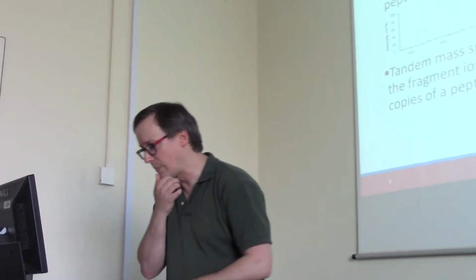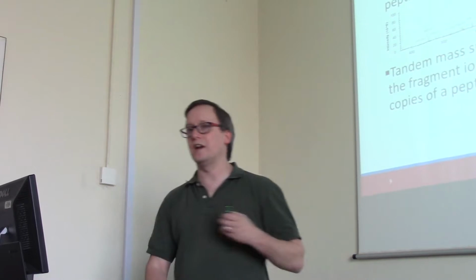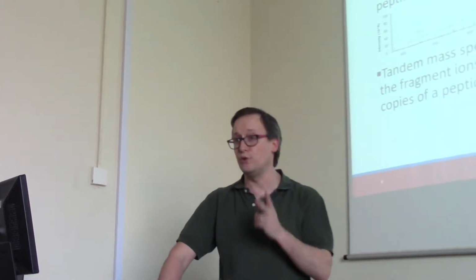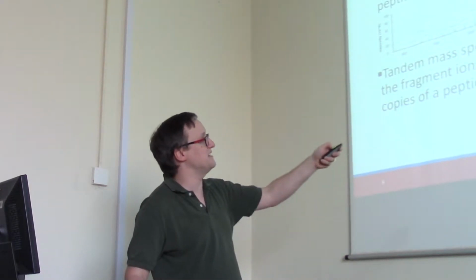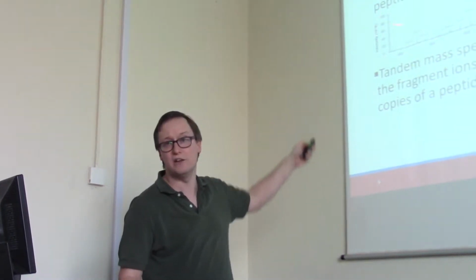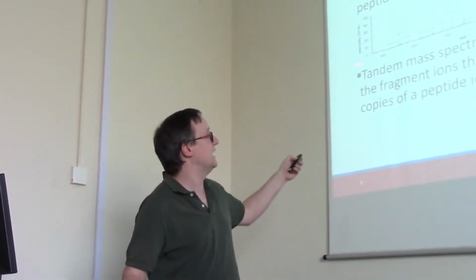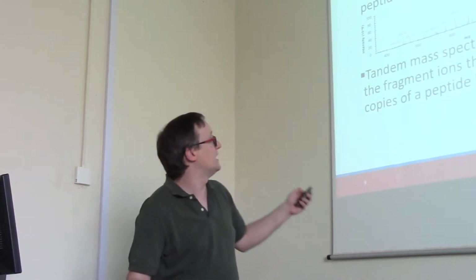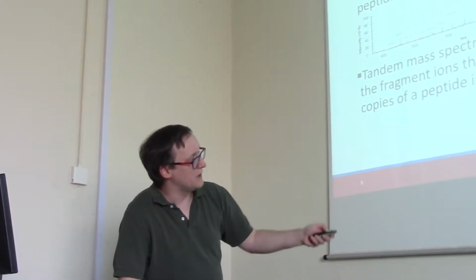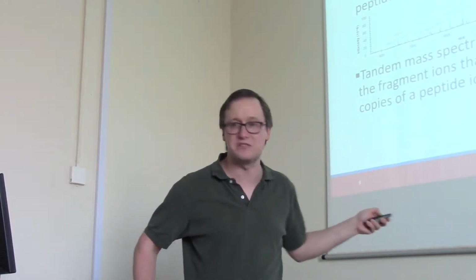Okay. So I've already emphasized this, but I'll cover it one last time. In shotgun proteomics, we typically have two different kinds of scans. They look very similar. This is a mass spectrum. It's an intensity scale. Intensity is kind of our proxy for how much of this particular ion there is. And across the x-axis, we have the mass to charge scale. A tandem mass spectrum is on the same axis. It's still intensity, it's still mass to charge.